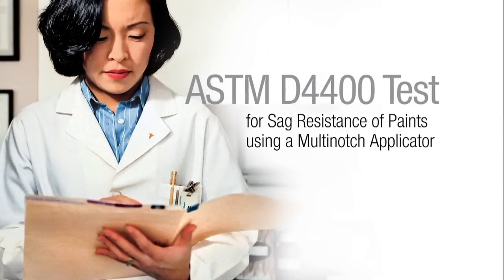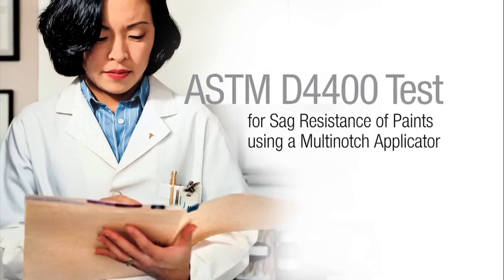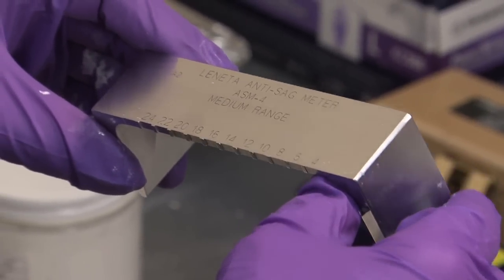We use this ASTM test to evaluate a paint's sag resistance. We start with an anti-sag meter, which is notched at precise intervals.